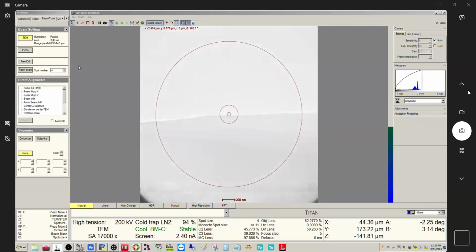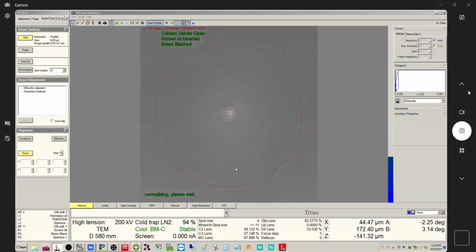Anyways, I'm going to put this right in the middle in terms of the parallel range. Right in the middle there, that's like 6, 7 micrometers. We'll put it at 6. And we want to make sure, something that's polycrystalline will work really well here. This is E-beam platinum, and this is polycrystalline chromium. Those will work fine for this. And we'll go into diffraction mode.